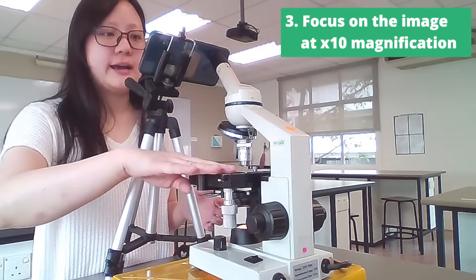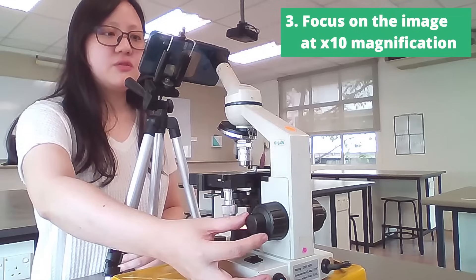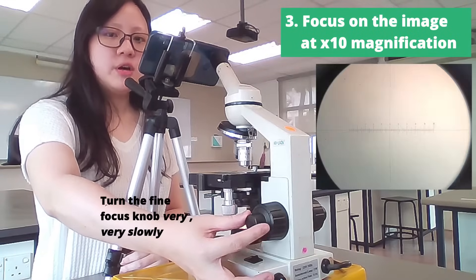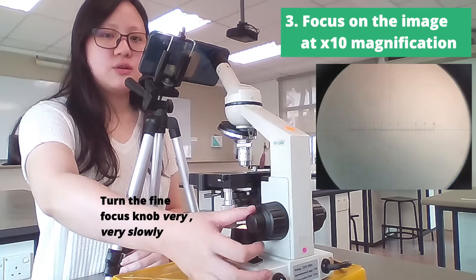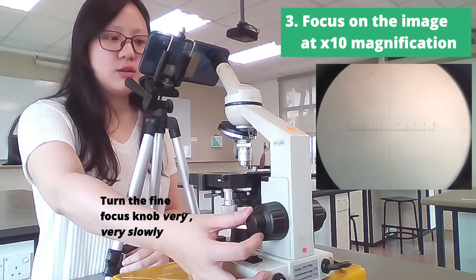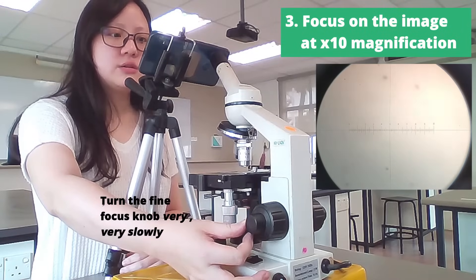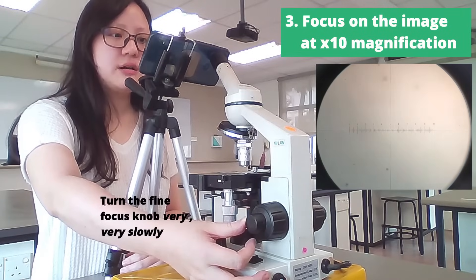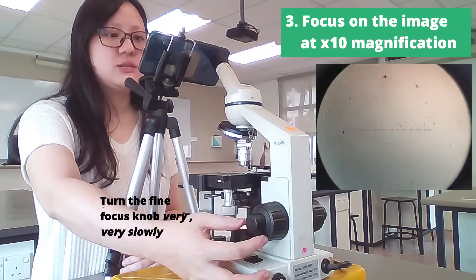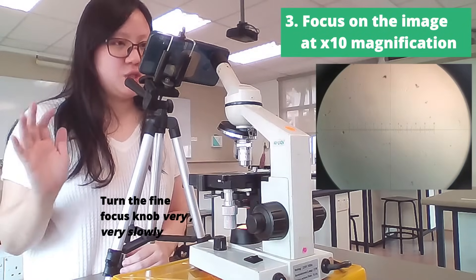Make sure that the stage is at the highest level. Then we're going to rotate this fine focus knob and turn it very, very slowly — I emphasize on the word slowly — very slowly, just turn it towards you until you can see some cell debris. These are cells that you can see in the microscope, but these are not yet your specimen.